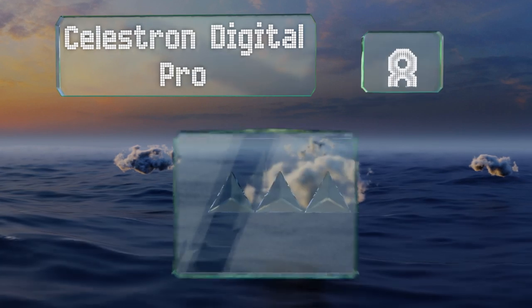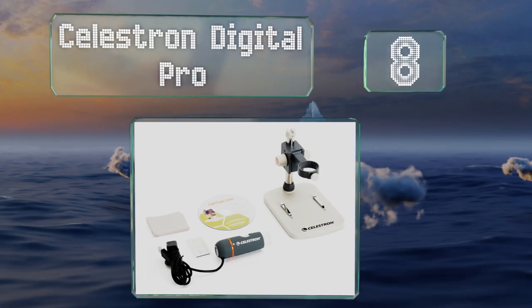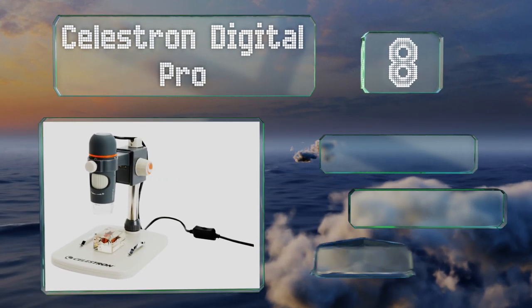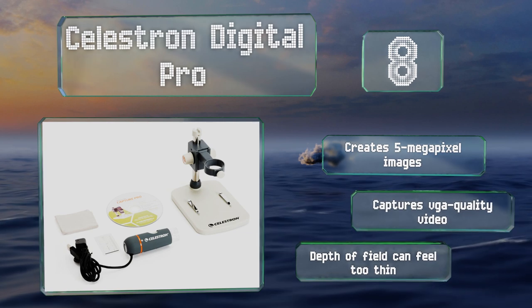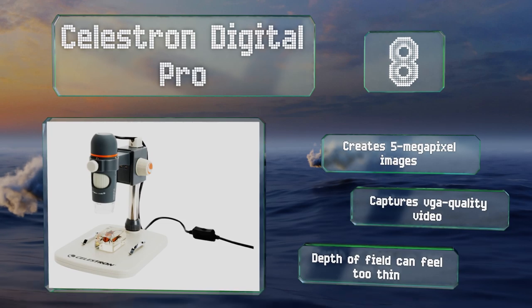Coming in at number eight, you can hold the Celestron Digital Pro in your hands and use its four-foot-long USB cable when magnifying things in hard-to-reach places. You can also mount it on its included adjustable stand when you want to inspect small items. It creates five megapixel images and captures VGA quality video, however its depth of field can feel too thin.